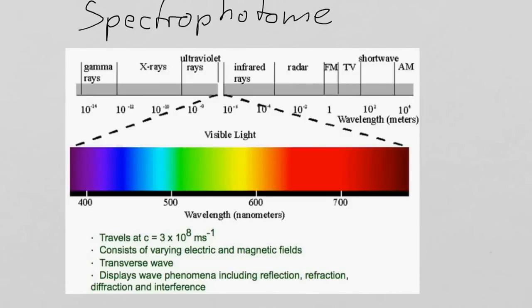So what happens when there is an electromagnetic wave, and I symbolize it like that. So that's a sort of a wave coming along. We know, for example, that light can be either just this energy thing, or it can be a little particle, but again, that's not something we need to worry about too much. So what happens if this wave hits matter? Let's say something like that.